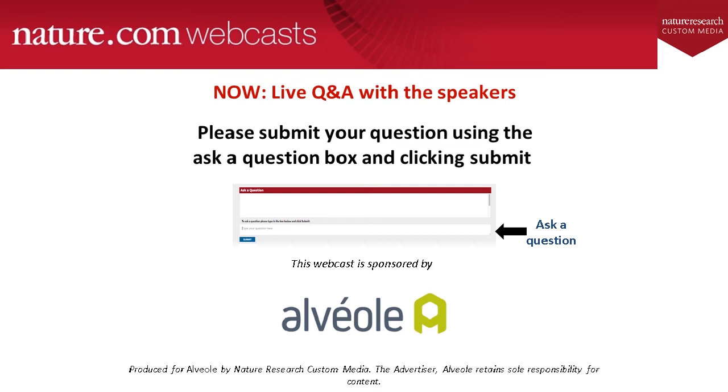Excellent. Thanks, Leeya. Our next question starts off by saying that this individual works with cells that are able to pull out the fibronectin from the substrate if the line width is around 1 to 2 micrometers. And what they've been doing is they've needed to form some sort of covalently bound fibronectin to the substrate. So their question is basically asking, did you also proceed to covalently bind on the grid?